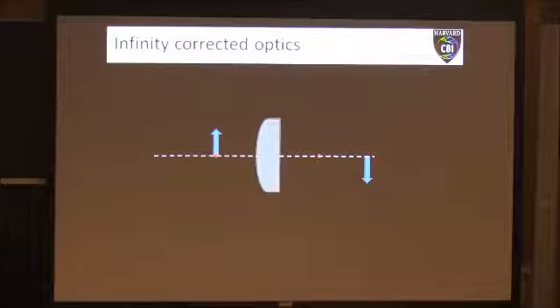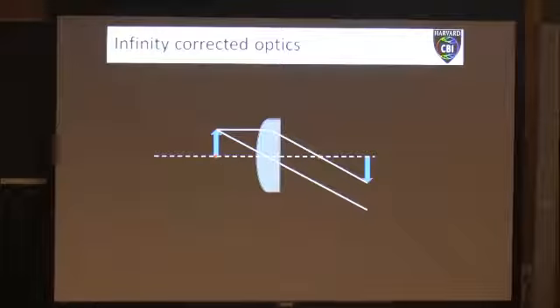So the idea here is that instead of our object sitting far away from our focal point or inside our focal point, it sits right on the focal point. Okay? And so if we do our ray drawings again, what's this going to do? We've got our first ray that comes parallel, refracts through the focal point, and comes down here. Our next one goes straight through the optical center of the lens. And our last one is useless because it's just going straight down. So what do you notice about these two rays here? Are they converging or diverging?